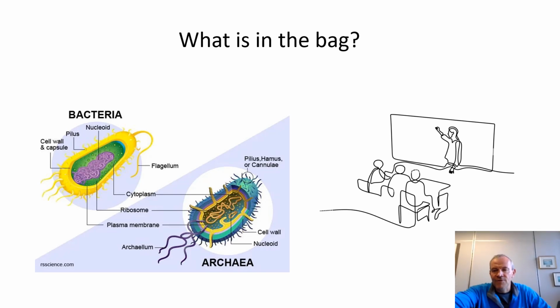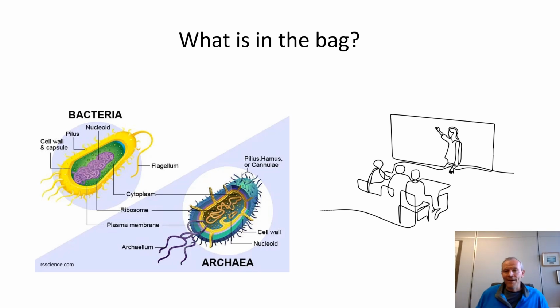Hi, CLB students. So you have your reactors or your anaerobic digesters, your bag now. And apart from being able to operate it, we're going to be spending a lot of time on that. We've got to go a bit further and constantly think of the process that's happening within your reactor. So what's in the bag?